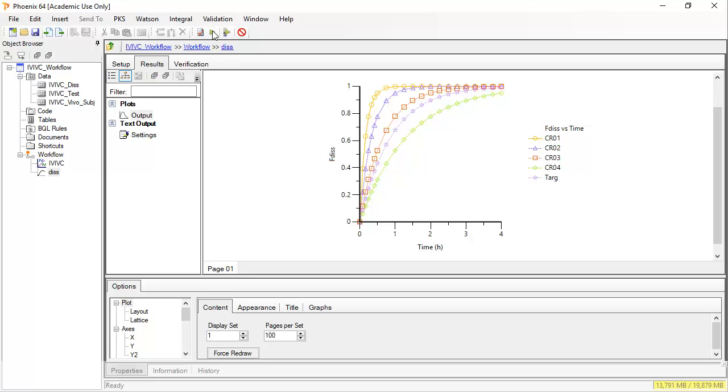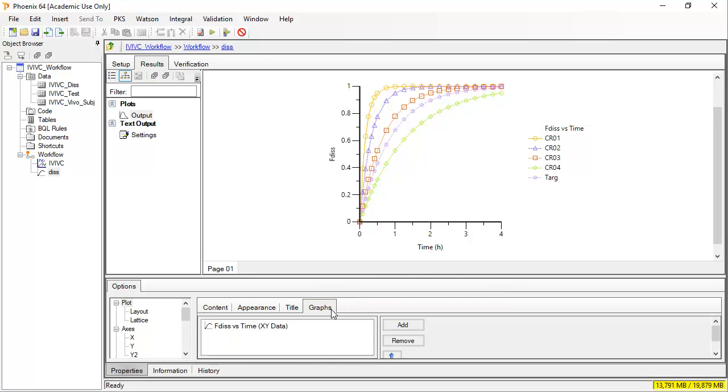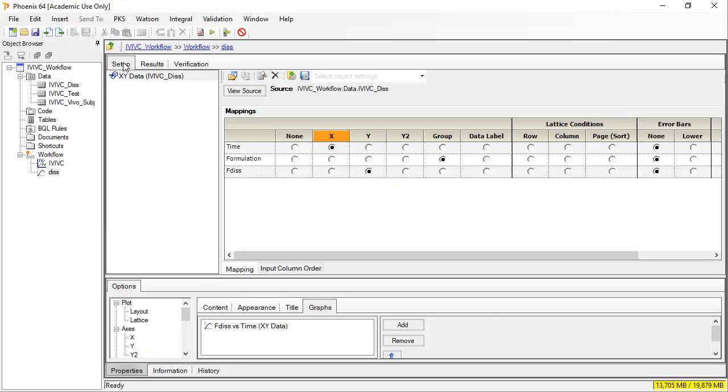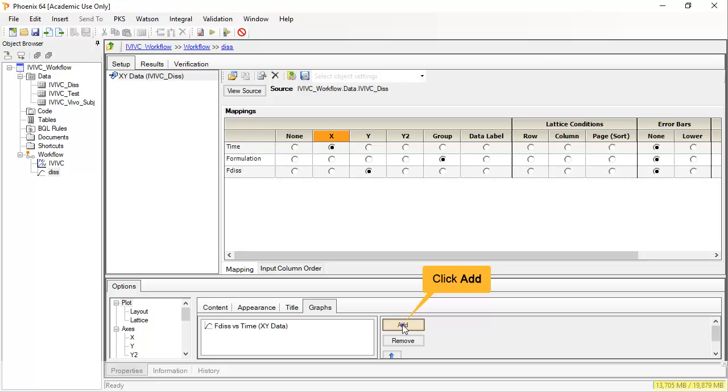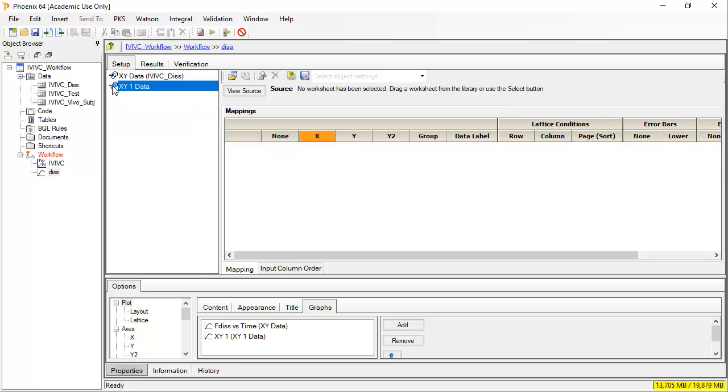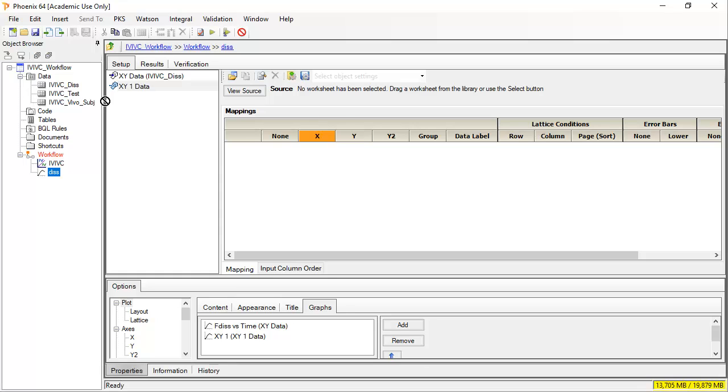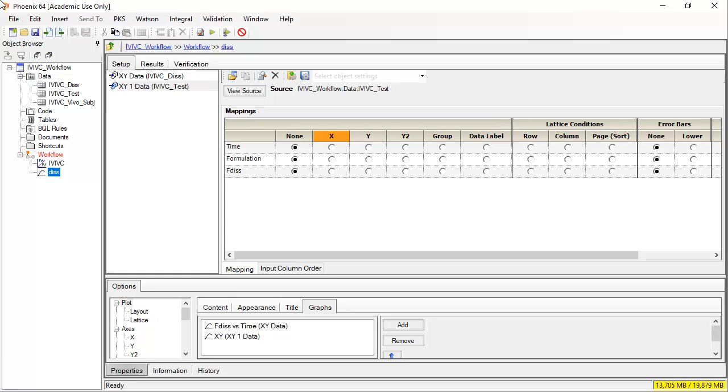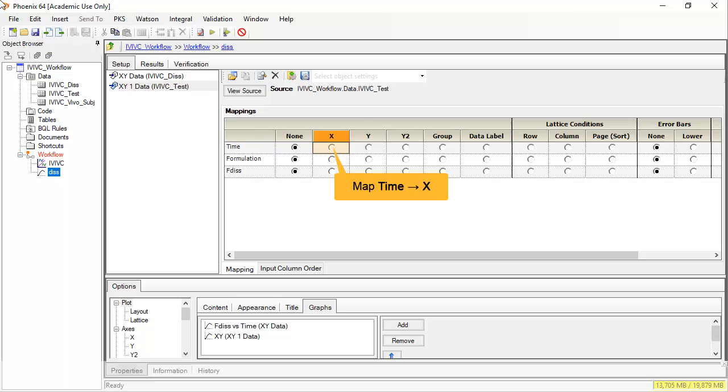I want to show you how you can overlay information from a second worksheet into the same plot. To do this, click on the graphs tab. I will select the setup tab so you can see how it changes. Now, when I click add, we will see the new input that is added. Note how XY data has a blue arrow indicating it has a data source, whilst XY1's arrow is still empty. This is because no source is mapped yet. I will drag the worksheet IVIVC test, which contains a new formulation for which only dissolution data is available.